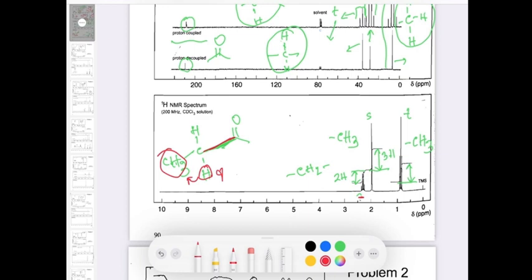Still we have one more CH3 on the carbonyl group, and that is a singlet, which means it doesn't have any neighbor. So you can put that CH3 group here. If you count the protons 3 bonds away, you will not see any neighbor for this specific group. If you count 1, 2, 3, 4, it is 4 bonds, but we are not considering 4 bonds. So finally, we can say this is the structure.